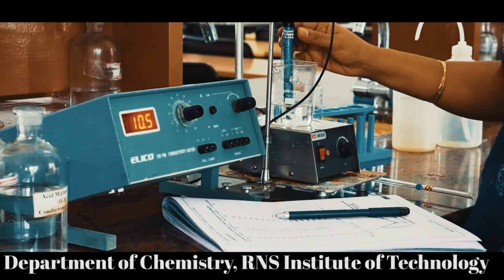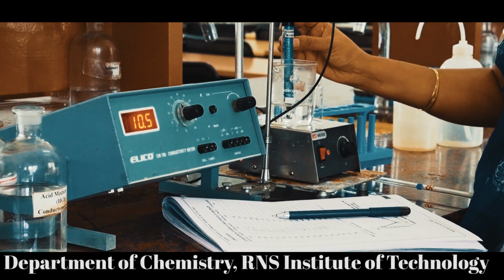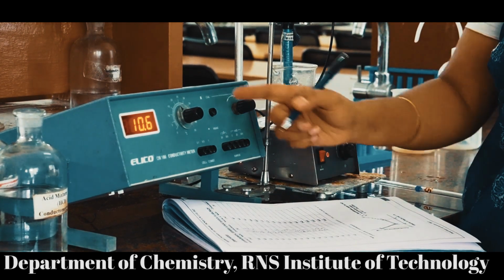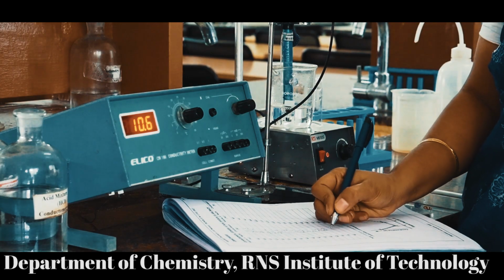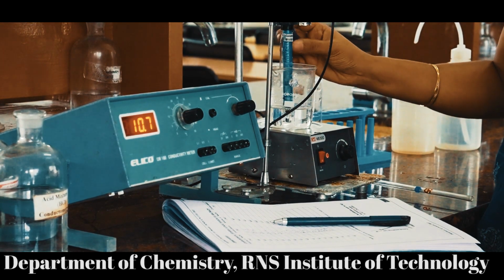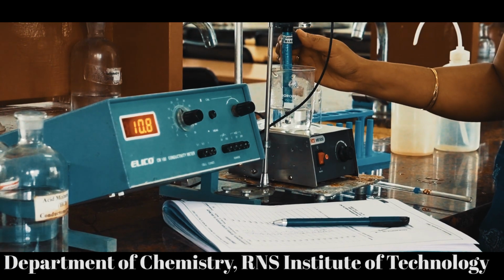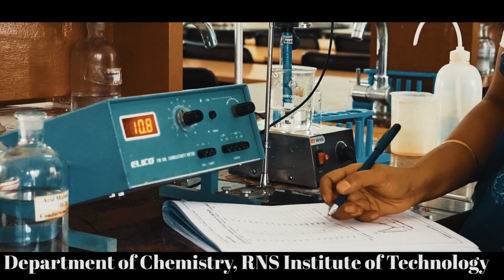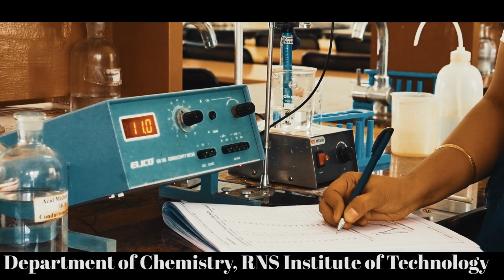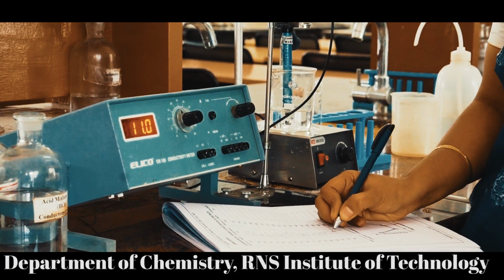Again add 0.5 ml, wait for 2 seconds, and note down. See, a slight increase, not too sharp, 10.7. Again add 0.5 ml, wait for 2 seconds, note down the reading. Same procedure. It's around 11.0.